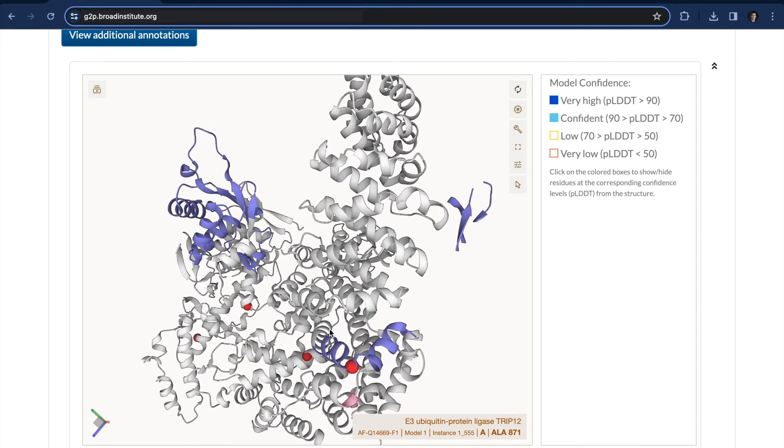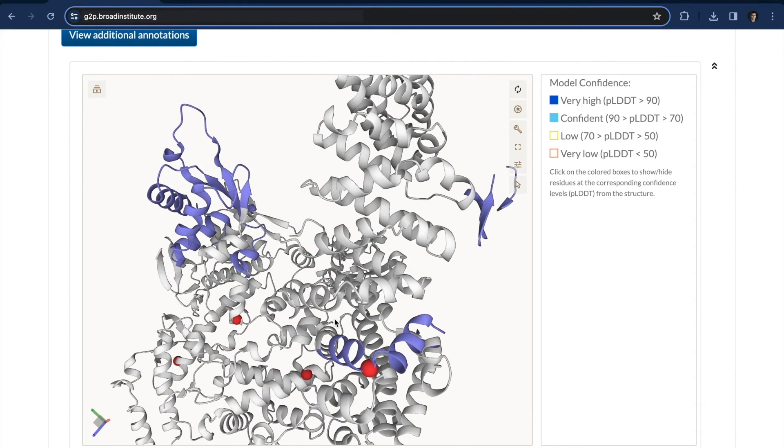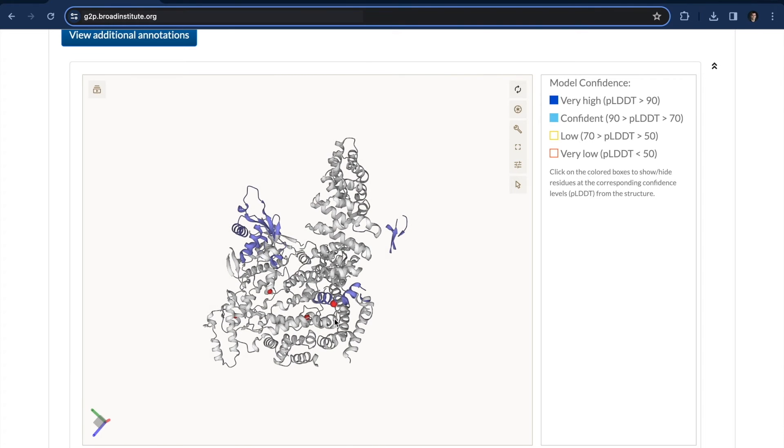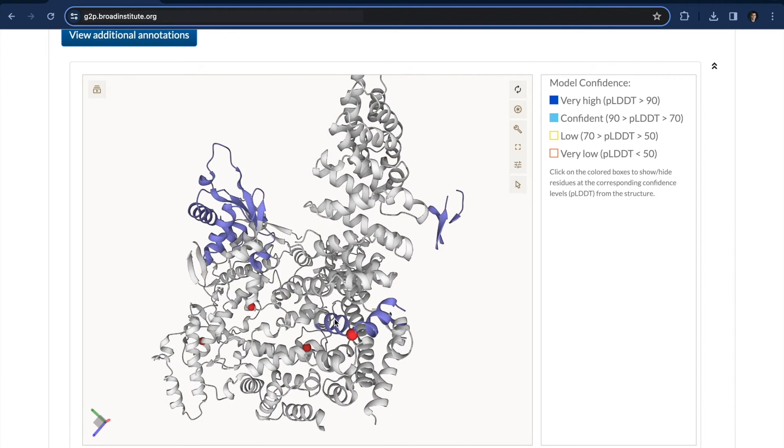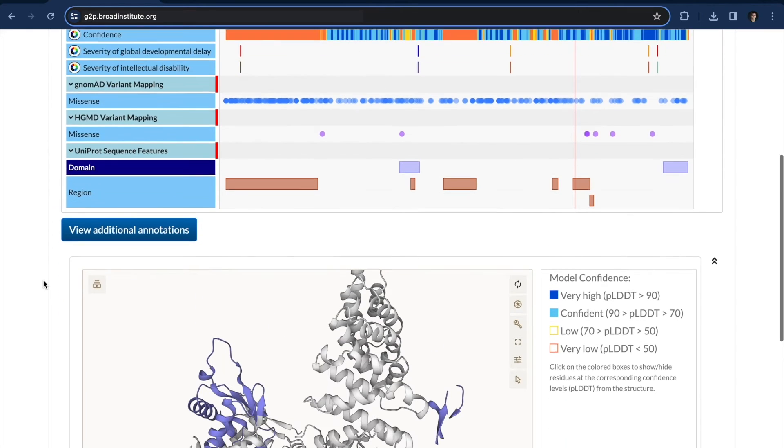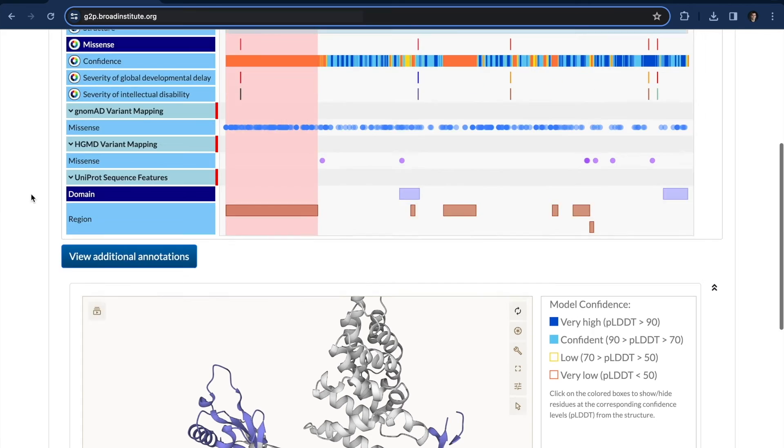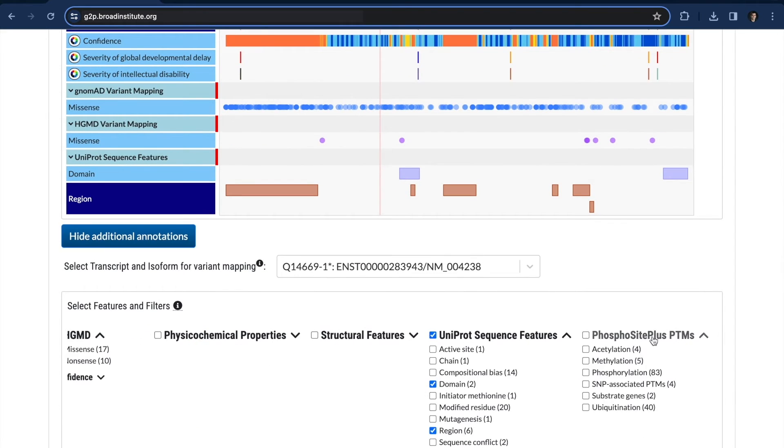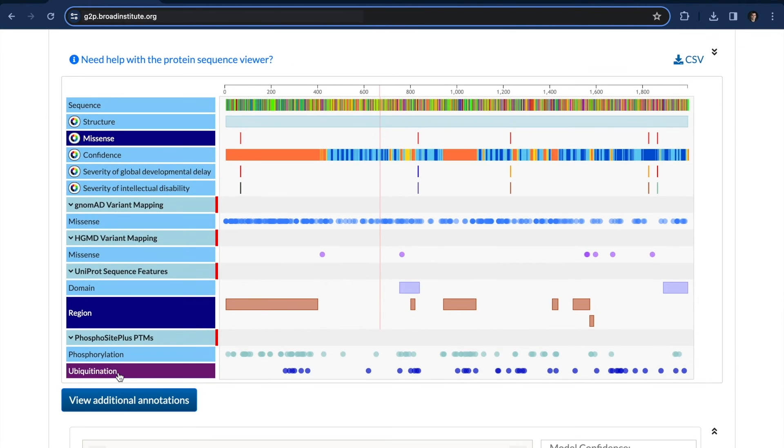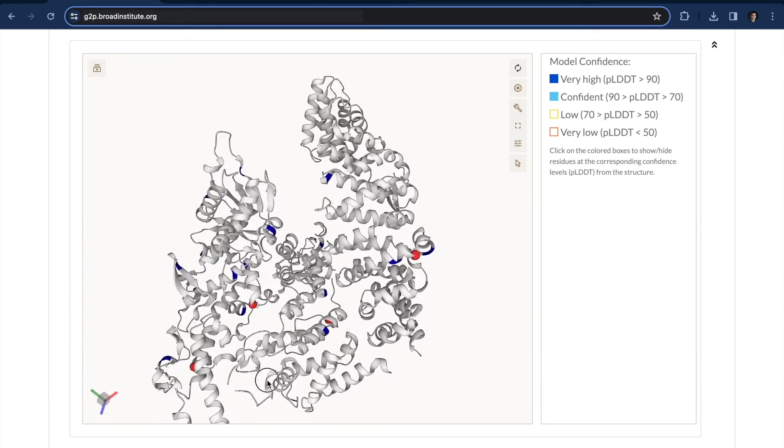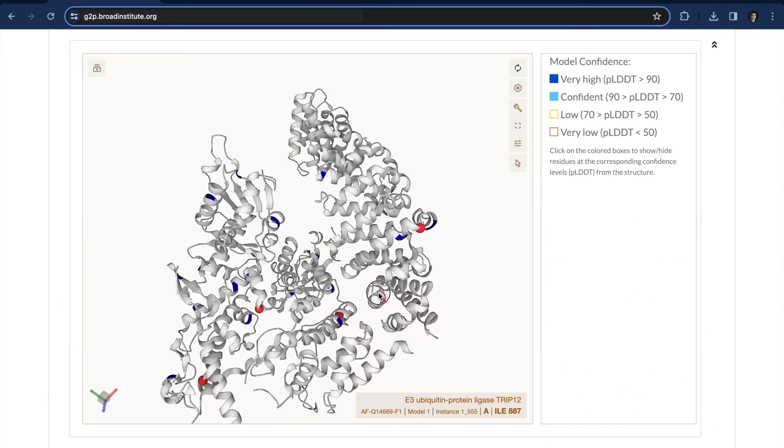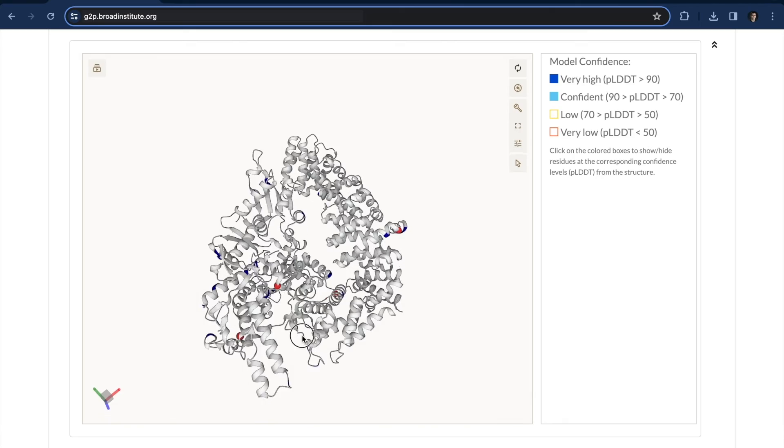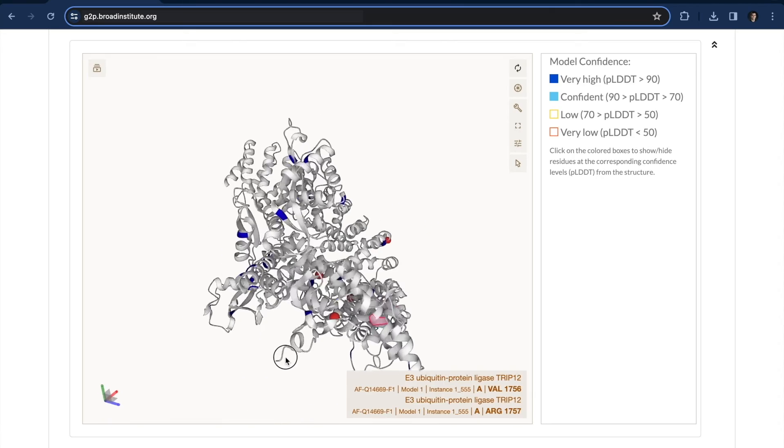which is found in a lot of ubiquitin protein ligases. So this domain is tied to regulating ubiquitination and protein degradation. And so is this specific mutation interfering in some way with a protein degradation pathway? So let's add the ubiquitin sites, and it actually really lines up. You can see that these mutations might be interfering with all of these different ubiquitin sites.